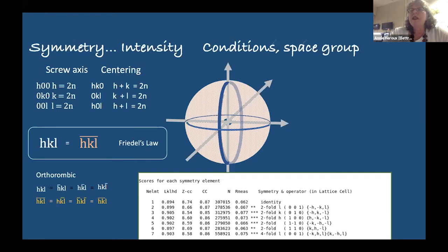We don't need to run a strategy saying we need to start at this angle, and if you start at 12 and go all the way to 92, you get all the unique reflections. Nowadays, within a couple of minutes, you can collect the whole sphere. But it's still ingrained in crystallographers to talk about strategy and space group and where to start. At this point, it goes very fast.